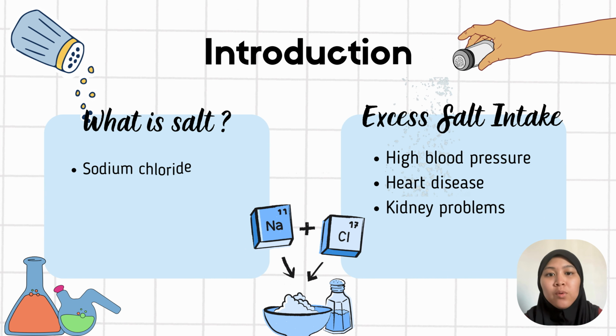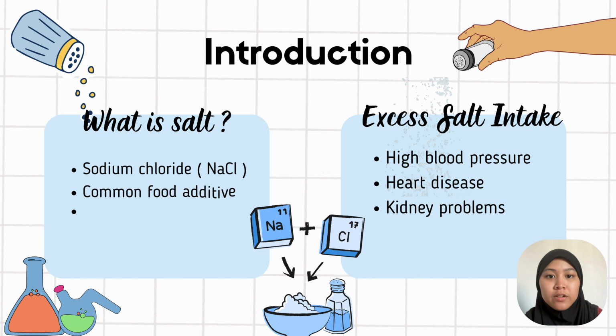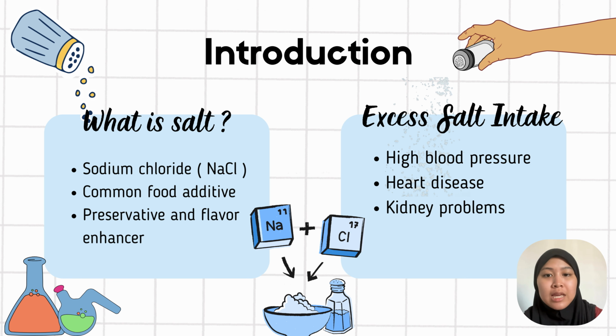We will present our topic entitled Determination of Salt Content in Food Products using Mohr titration. Salt, or sodium chloride, is one of the most widely used additives in food products. It not only enhances flavor but also acts as a preservative and helps improve texture and shelf life.